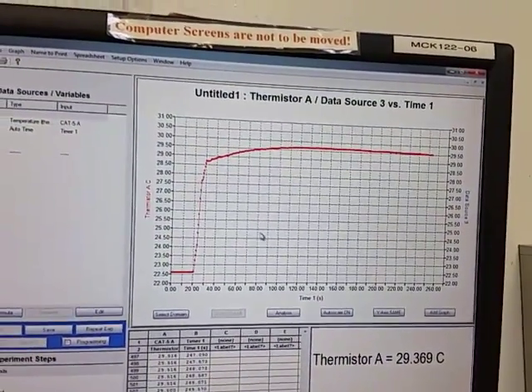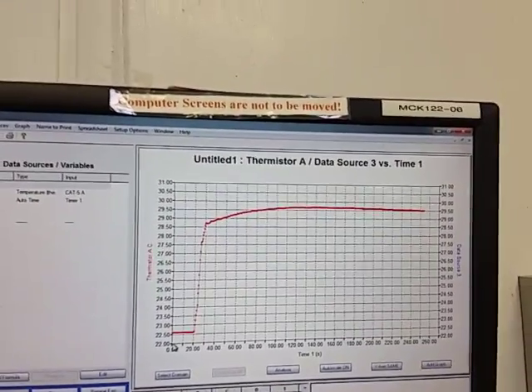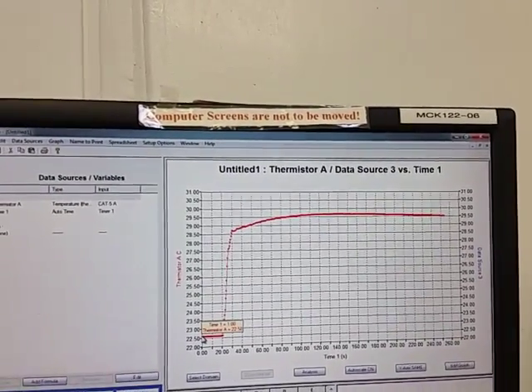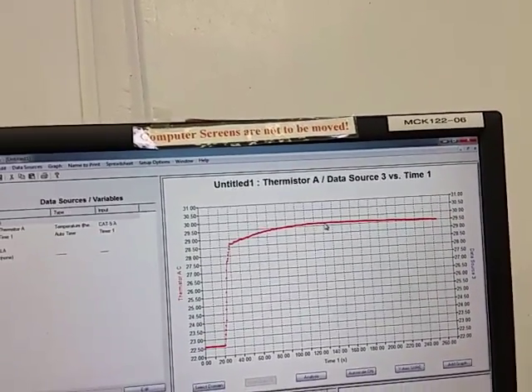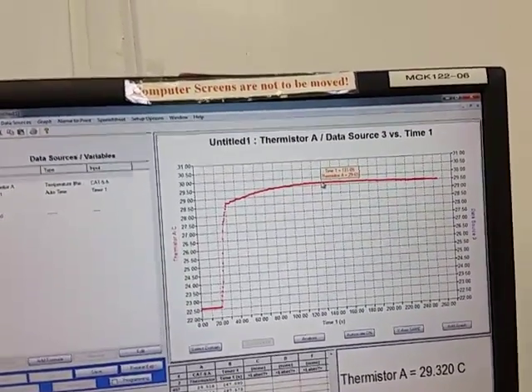All right, so with our data here, now we want to identify the temperature final and temperature initial. The temperature initial, we can just go ahead and rest the mouse over on the bottom left there. Yeah, just move it just up until it gets to the red line. Hold it right there and just wait. Now there, so it's 22.5, all right? And then go up to the highest point, which is right about there, yeah. 29.65. And the temperature initial, what was the temperature initial? 22.5?